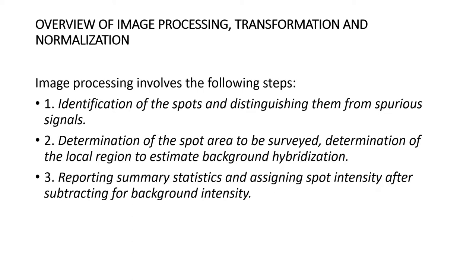Second important thing is determination of the spot area to be surveyed. So we need to identify the area that we should consider for the analysis. Then determination of the local region to estimate background hybridization, because the background intensity also may cause problems in the analysis.